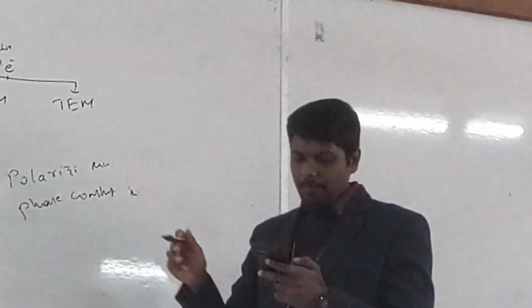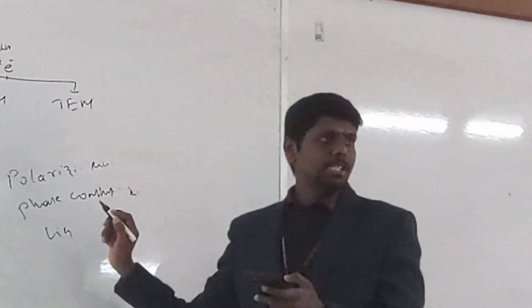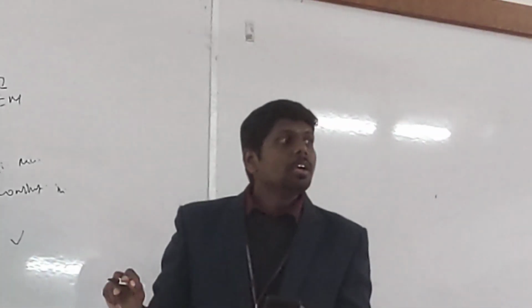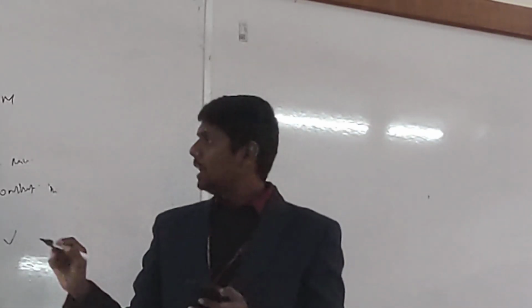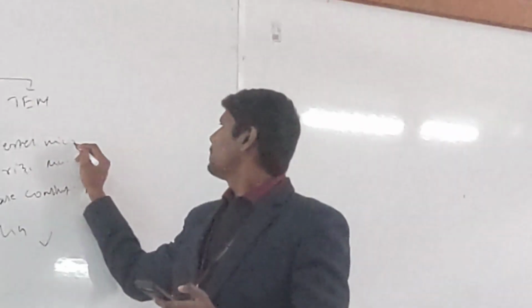Contrast microscope, then? Light microscope we discussed. Inverted microscope. Inverted microscope, okay.